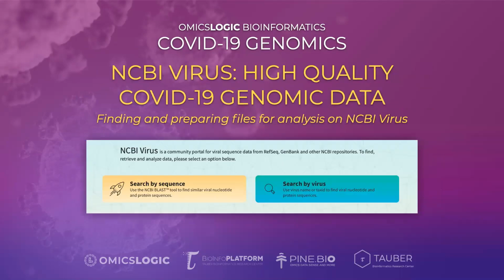Then we'll talk about finding specific data sets from different locations and different types of sources, like different hosts, different locations around the world, and different time points where those were sampled, and using those for analysis. We'll do both exploratory analysis, where we just get an overview of what's going on, and then developing a specific analysis question. What do you want to have answered with this type of data?